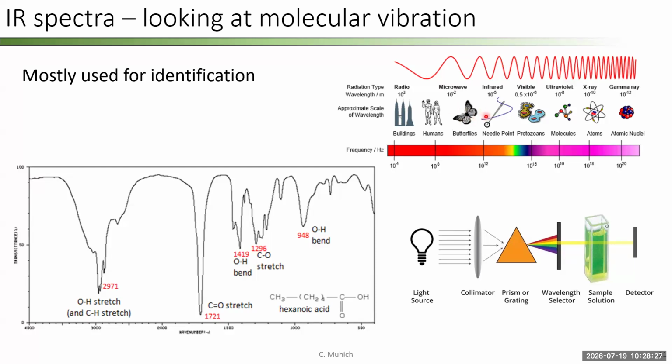What happens in this spectrometer is we pass light through the cuvette and we see how much has been absorbed, or rather, how much has not gone through, right? I know how much light I send into the cuvette. I measure how much comes out. So any amount that doesn't come through has been absorbed. And we measure this absorption spectrum.